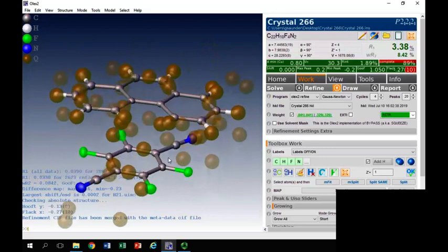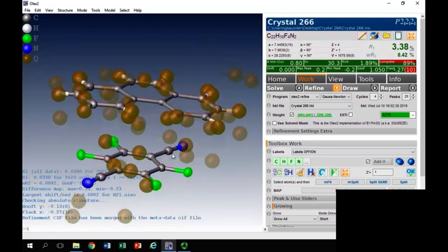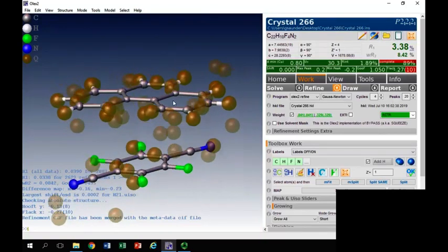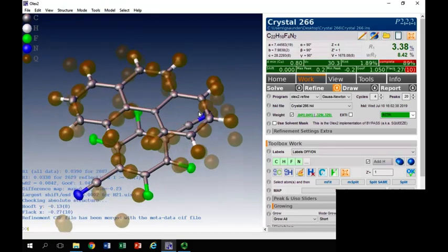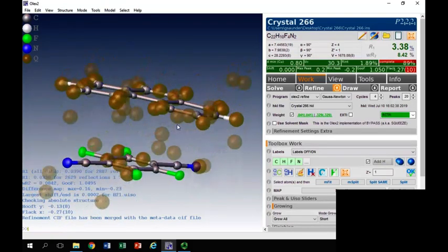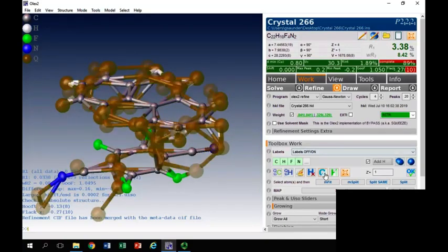Okay, there's a few spurious peaks. You know, it's where we might expect there to be electron density, close to atoms or in bonds, close to the hydrogen atoms. The more transparent they are, the less the electron density. Okay, so there's not really one big one that's sticking out. We haven't forgotten a water molecule in there or anything else. Okay, so we can just ignore those.